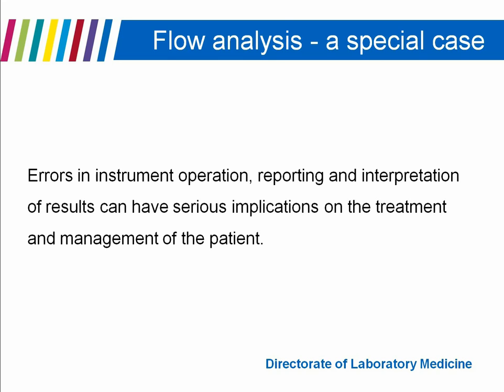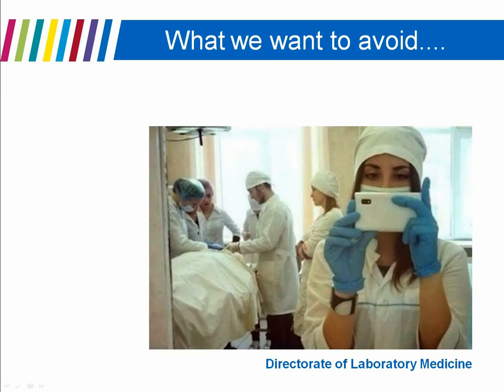And it's important that our staff know what they can and can't do with a flow cytometer, know the limitations of the instrument, know what to do if something goes wrong, and know what the consequences are of changing the parameters of the instrument. So yes, flow analysis, we consider it to be a special case.